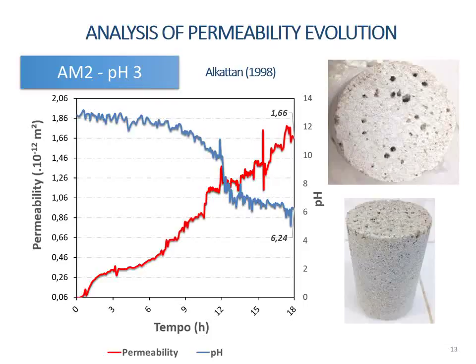From this and the results obtained with the test of the rock submitted to the fluids of pH 2 and 3, it was decided to reduce the acidity of the reactive solution in the test with the carbonatic rock AM3, and therefore to observe the influence of the speed of reaction of the carbonate.